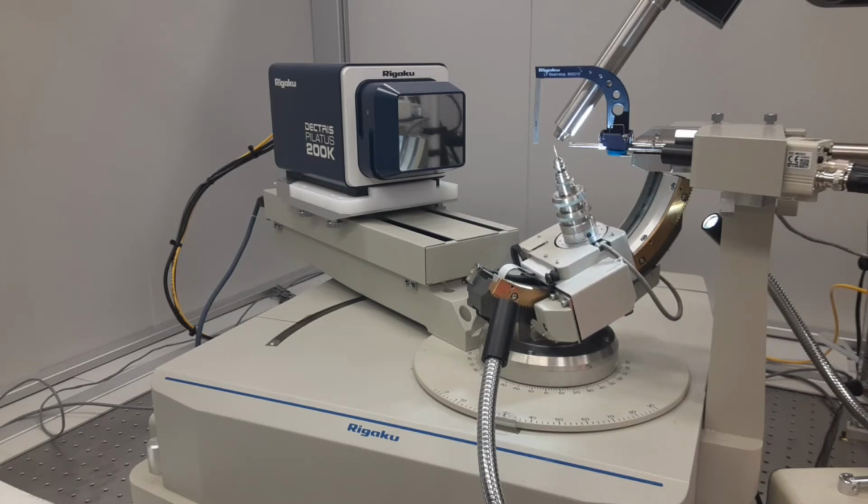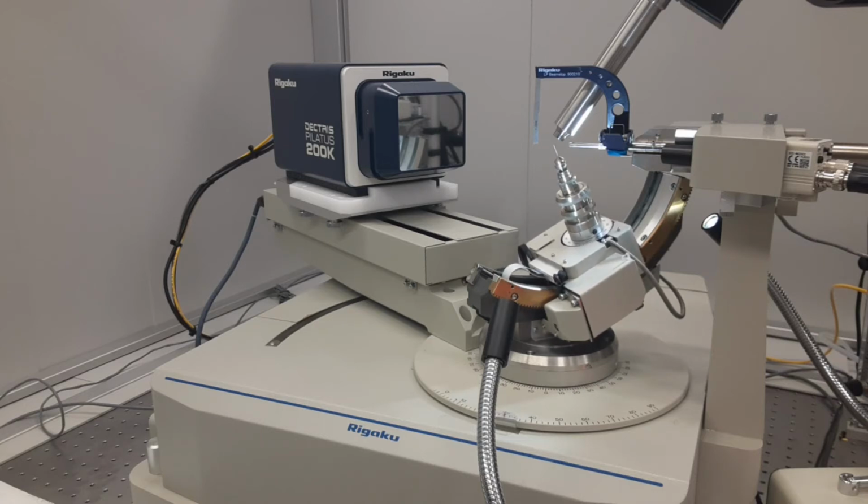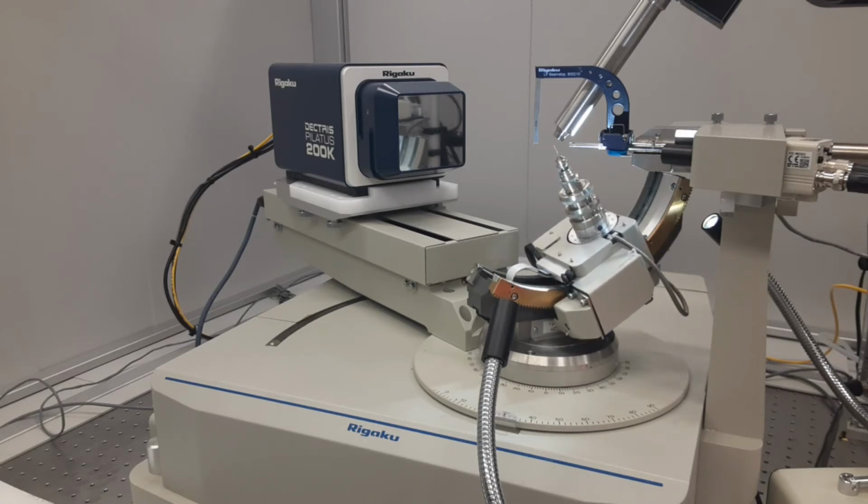And then what phi does is it rotates the crystal independently of omega, which is the collection axis. So if you look closely, you can see phi being moved.